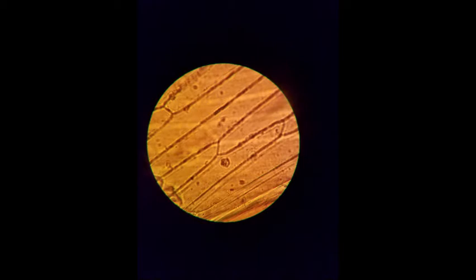Now view the cells again. Can you see them more clearly? Draw an onion cell and observe it under the 40x objective. Label the nucleus, the cell wall, and the cytoplasm.